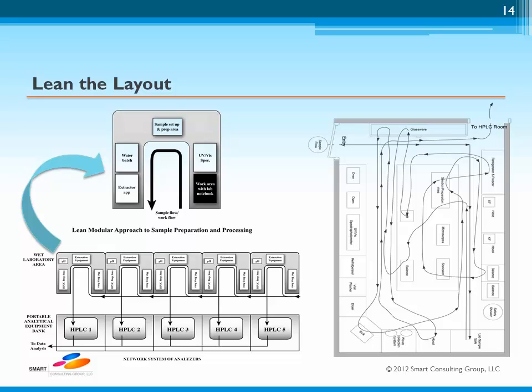Use of spaghetti diagrams is particularly helpful. They can be used to visually highlight the major areas of deficiency. Using these maps, it's easy to see the lack of coordination occurring in the laboratory, as evidenced, for example, by the long distance traveled by the analysts and the sample flow around the area. It's easy to understand then that this increases cycle times, preparation workup, and batching of samples.